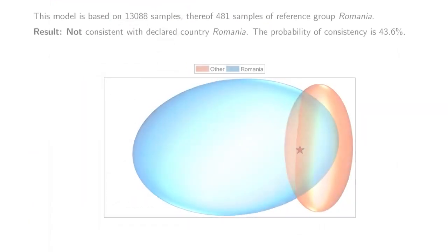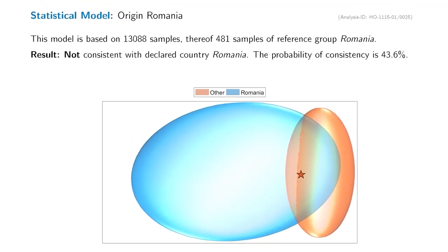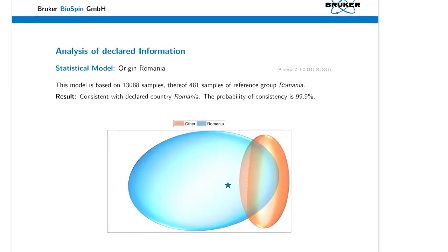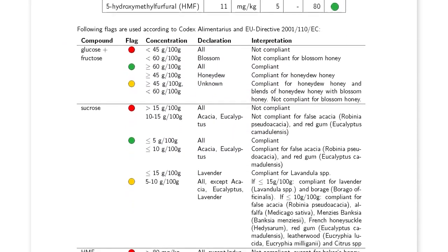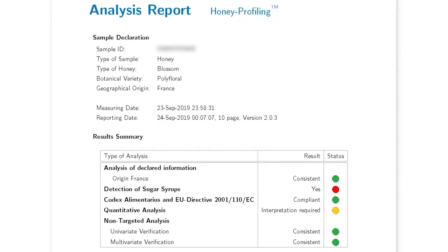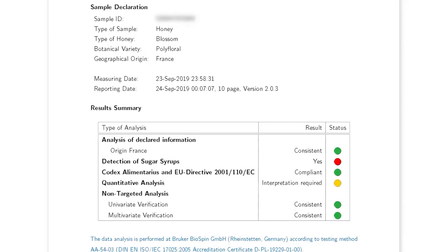The report combines quantitative and statistical analysis results, indicating if the honey sample is compliant to the declared geographical origin and floral source, if it is typical to the reference honeys in the database, and if it contains sugar syrups.